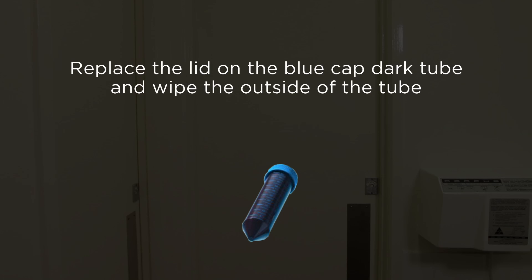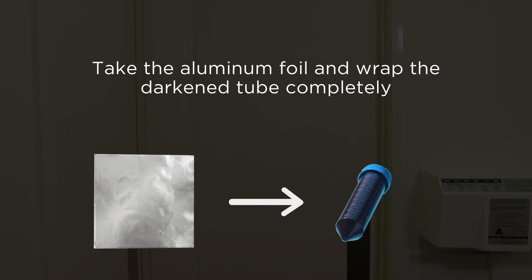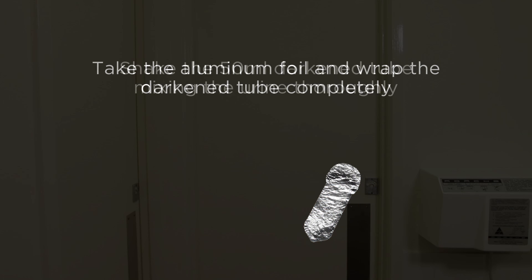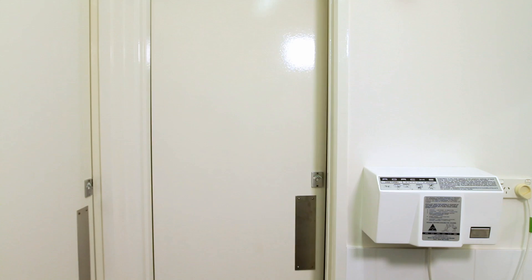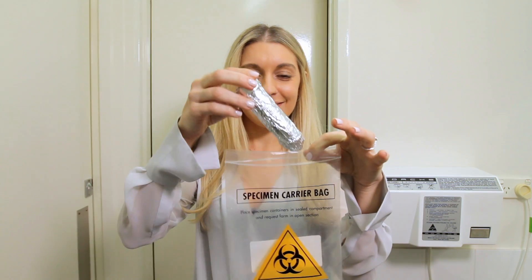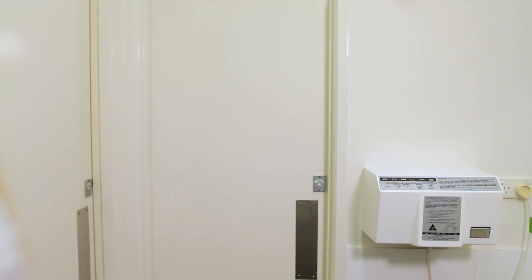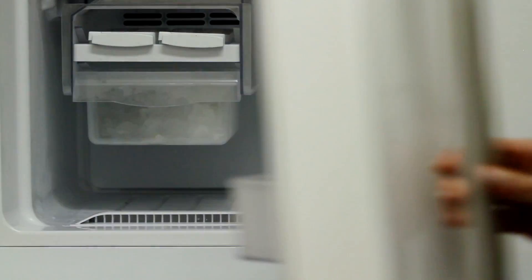Replace the lid of the 50 milliliter dark blue screw cap tube and secure tightly. Ensure the tube is wiped clean. Now take the aluminium foil and completely wrap the dark screw cap container, making sure all parts are covered. Shake the 50 milliliter dark blue screw cap tube to ensure the urine has mixed thoroughly with the ascorbic acid powder. Place the sample into the sealable section of the specimen transport bag and then immediately place it directly into the freezer.